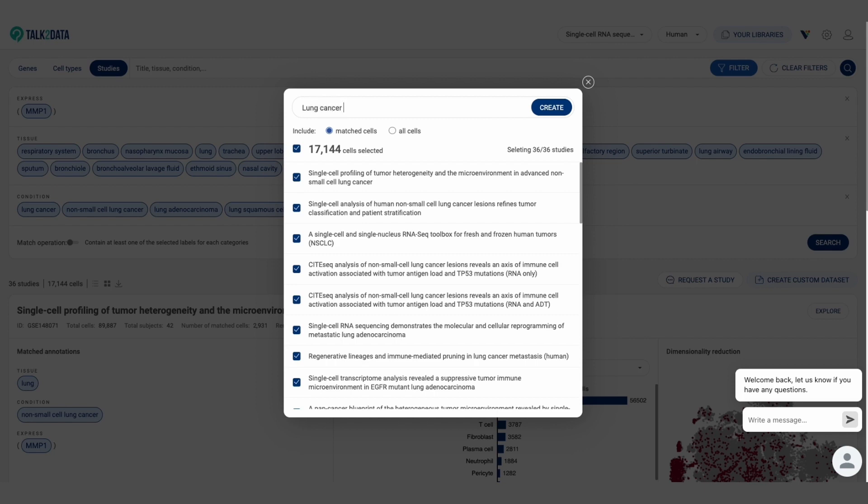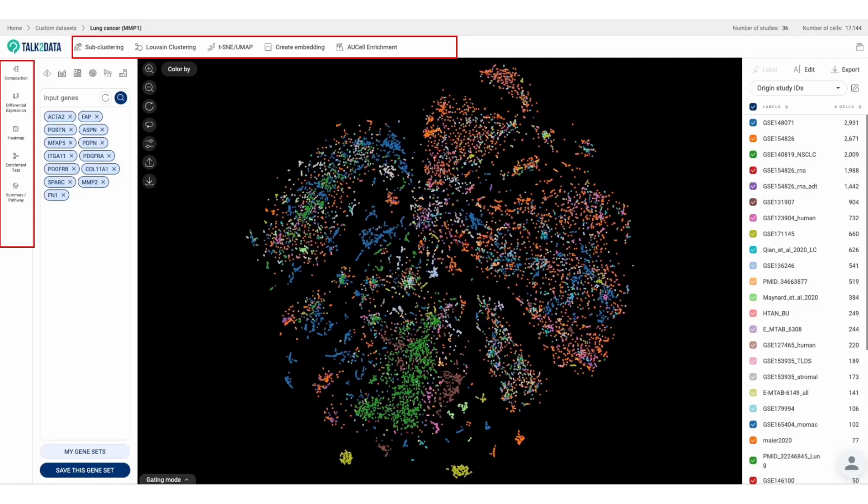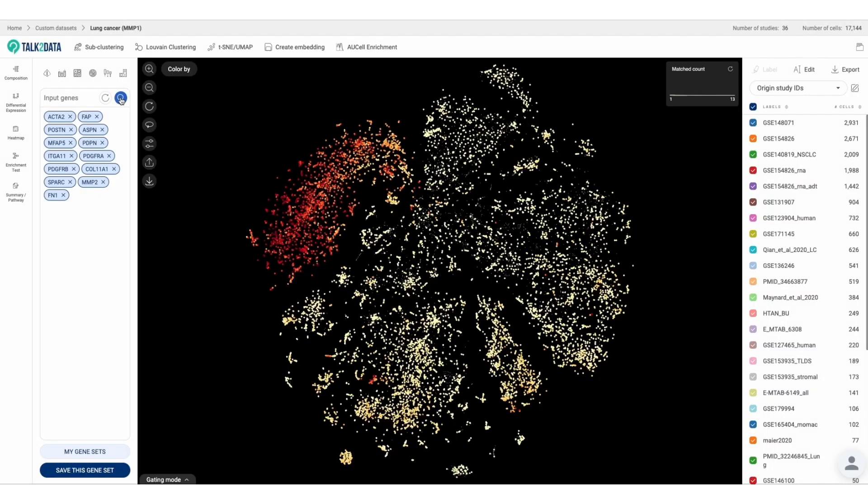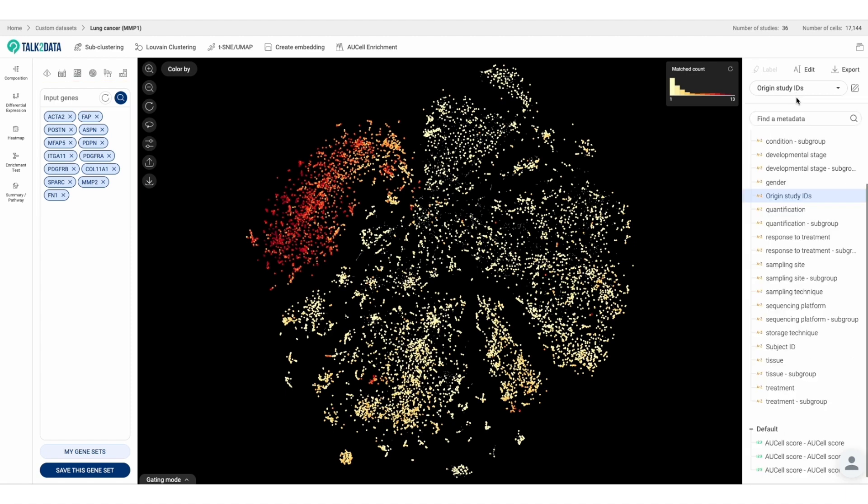We also provide you different ways to analyze the atlas, including t-SNE, UMAP, and Harmony. Let's look at the expression of cancer-associated fibroblasts (CAFs), one of the most important players in tumorigenesis.